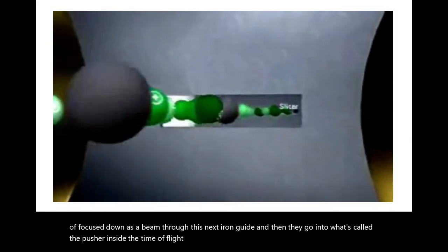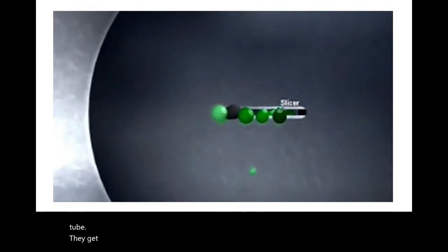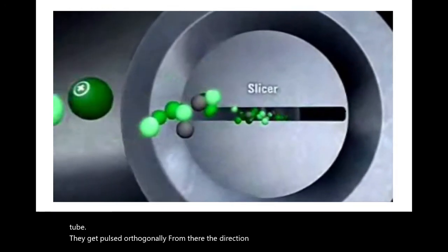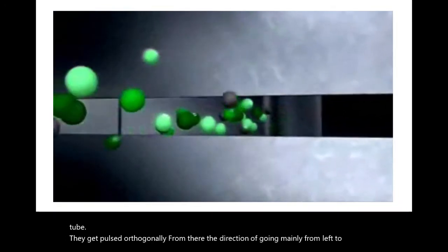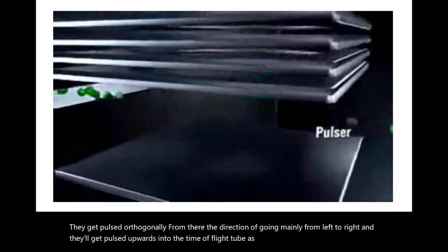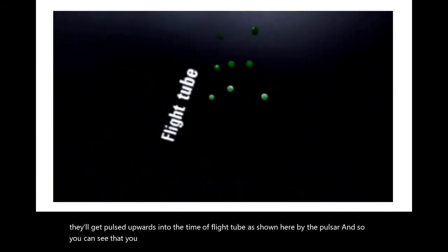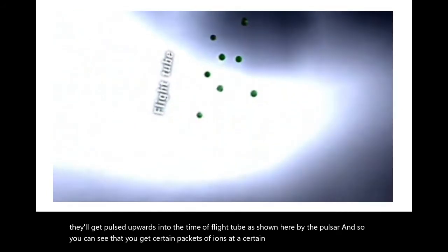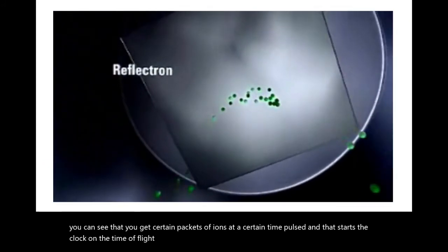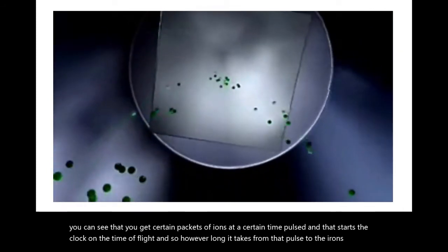So once they get into the time of flight tube, they get pulsed orthogonally from the direction of going mainly from left to right, and they'll get pulsed upwards into the time of flight tube as shown here by the pulsar. And so you can see that you get certain packets of ions at a certain time pulsed, and that starts the clock on the time of flight. And so however long it takes from that pulse to the ions hitting the detector is related to the mass.